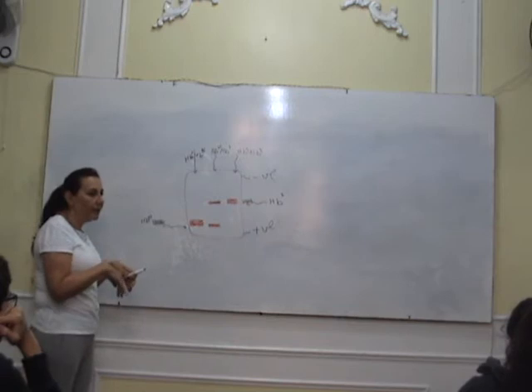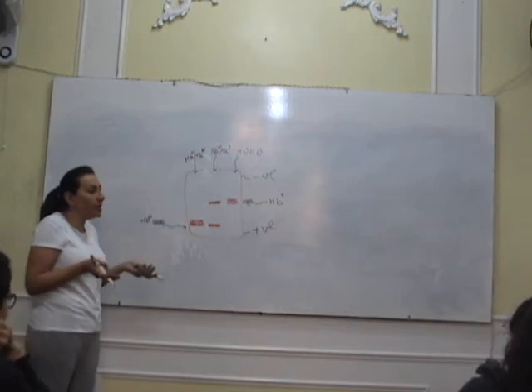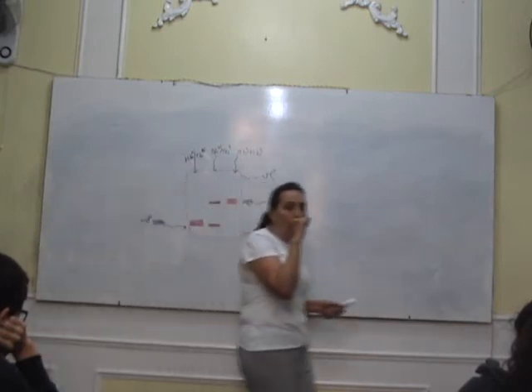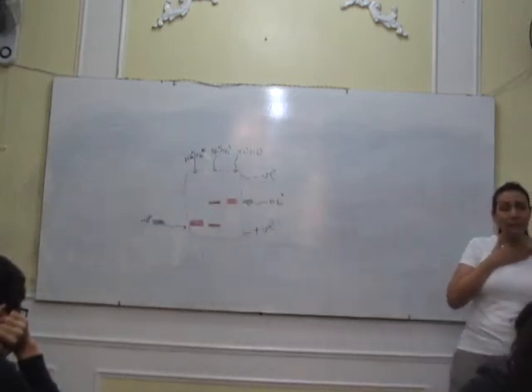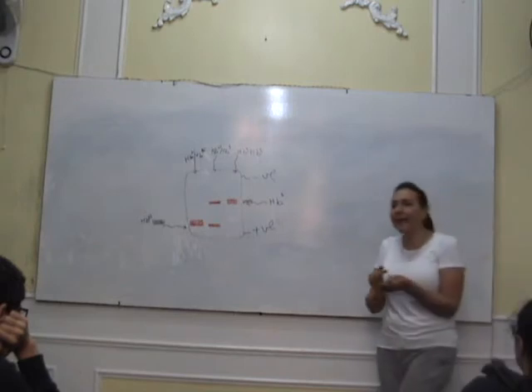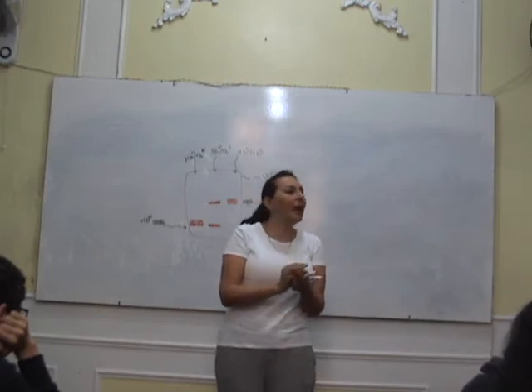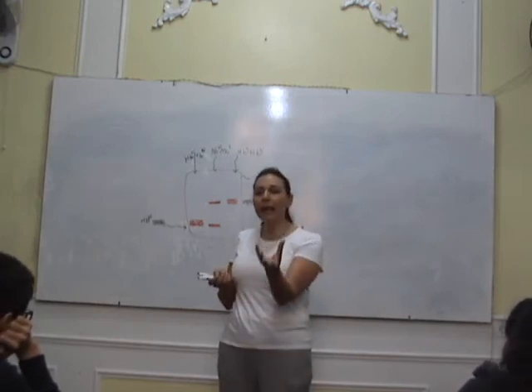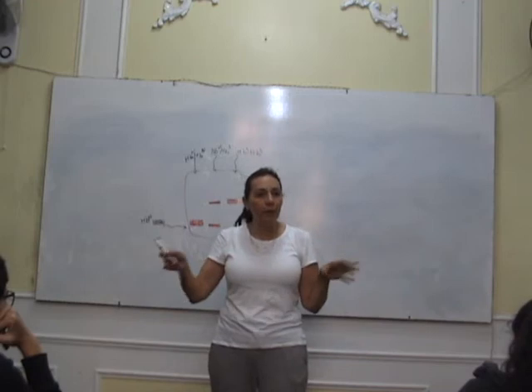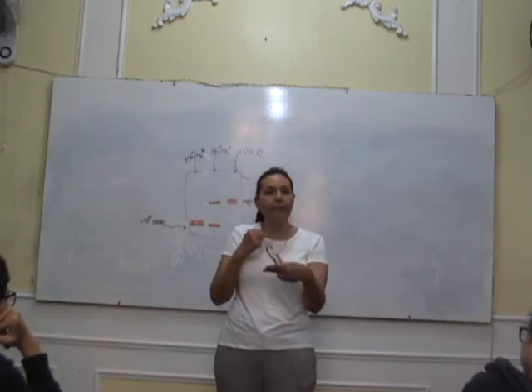ده الجل لا انا حاطه البروتين نفسه، انا حاطه الهيموجلوبين نفسه هنا. I'm separating proteins not the DNA. I'm isolating the hemoglobin. انا هنا ما بستعملش restriction enzymes، انا مش بقطع ال DNA. انا هنا I am taking the hemoglobin ذات نفسه، علشان اقدر اعرف the person that heterozygous is he a trait ولا is he homozygous sickle ولا is he homozygous normal. فانا باخد الهيموجلوبين بتاعه وبعمل له جل الكتروفوريسيس واشوف البانز بتاعت الهيموجلوبين واقف فين.